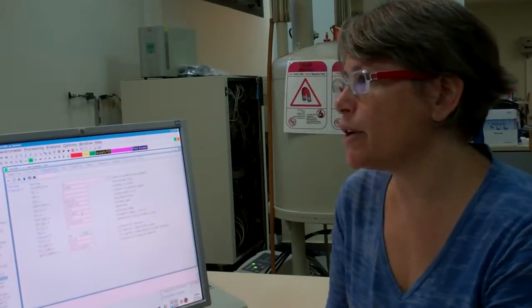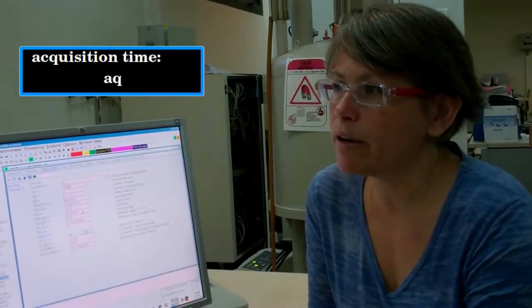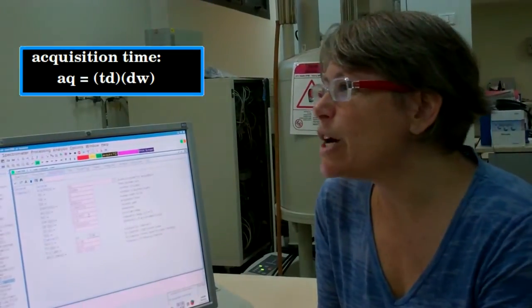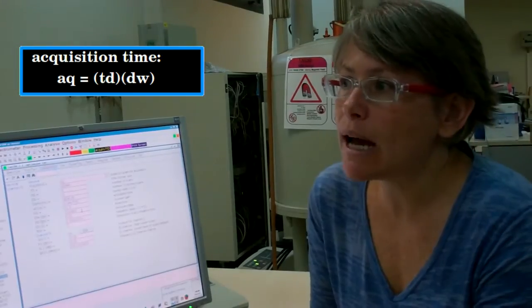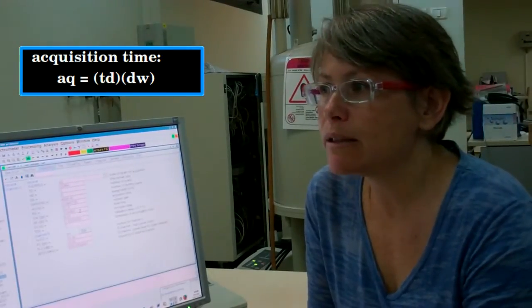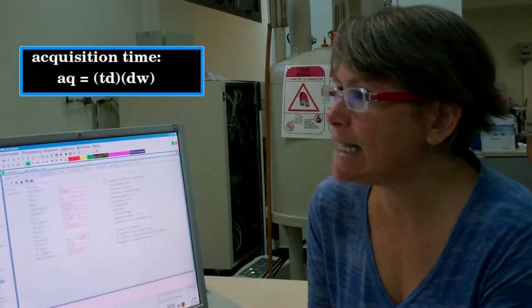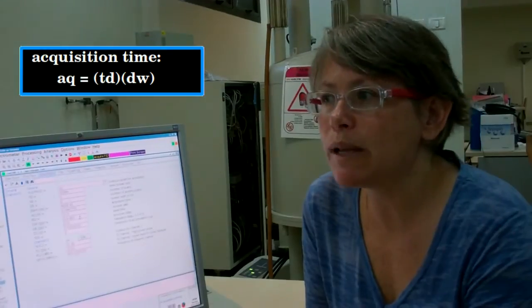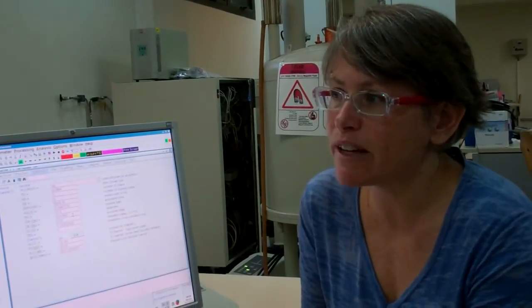The next parameter is the acquisition time. This is the time that the detector is on, or the time during which the FID is being recorded. How long is that? It's the number of times the signal intensity is recorded, multiplied by the time interval between each point. So AQ, our acquisition time, is equal to TD, the number of points used to digitize the FID, multiplied by the dwell time, which is determined by 1 over twice the specified spectral width.